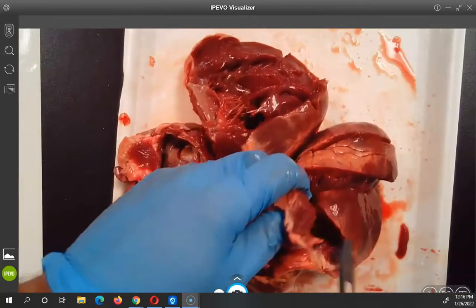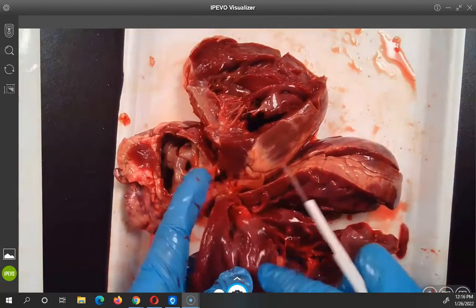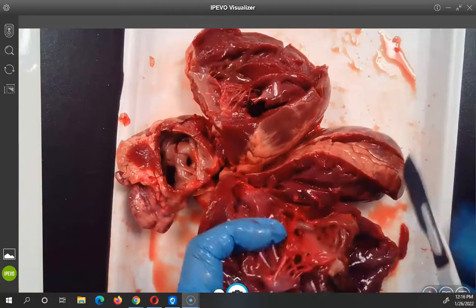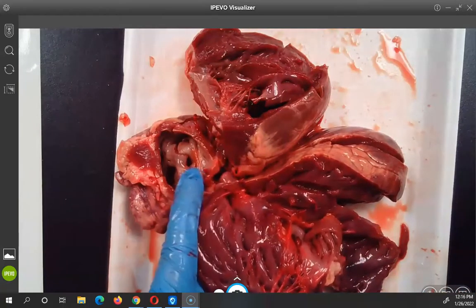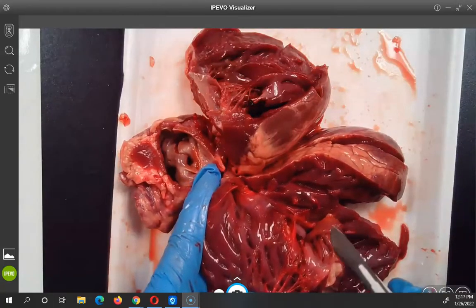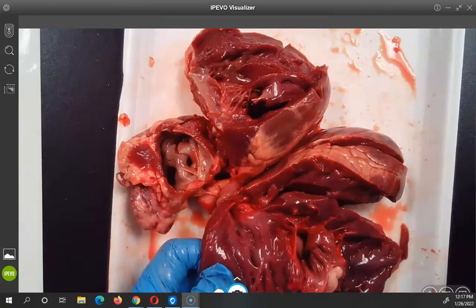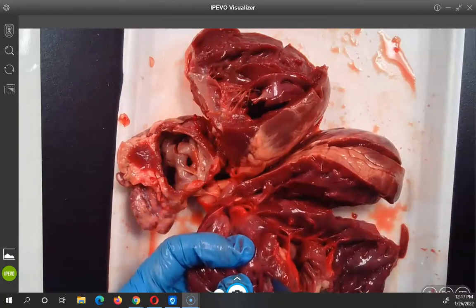I want to buy a big heart so I can dissect it. Well, you can get it at your local butcher. Very nice and smooth. Yeah, this looks like those alien movies where they have all these tendril things — or the parasitic ones, like the aliens that attach to your face and implant their egg. A symbiote would be better because a symbiote keeps you alive, whereas a parasite just kills you.